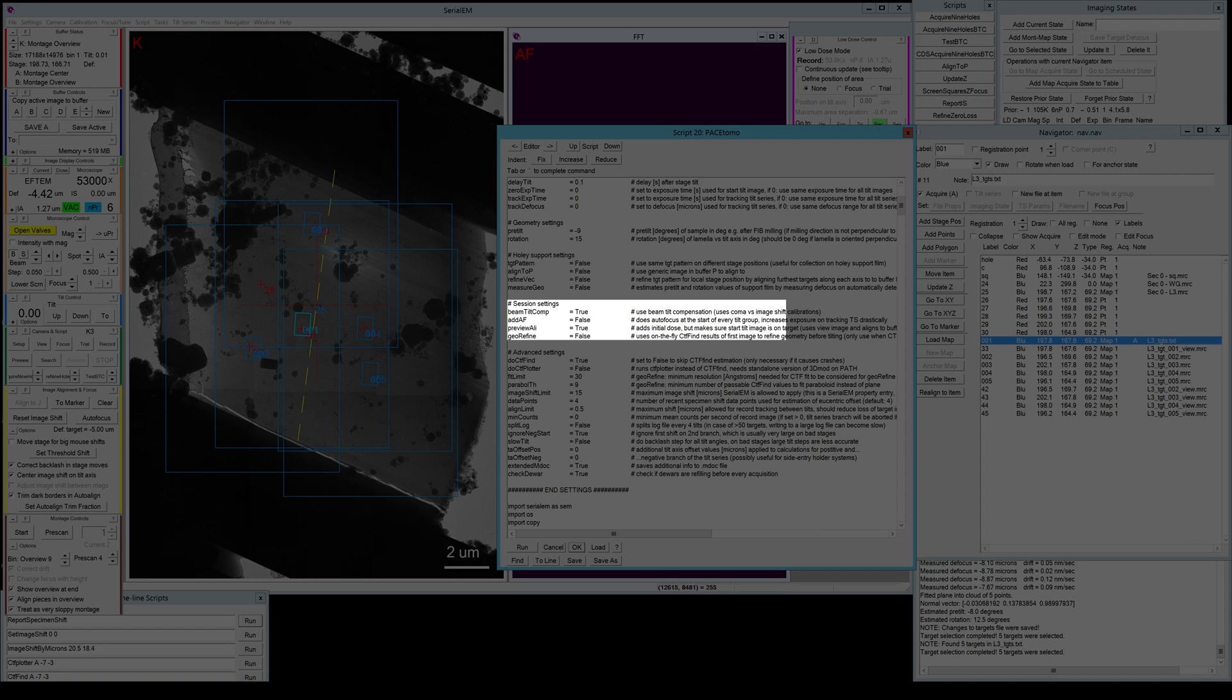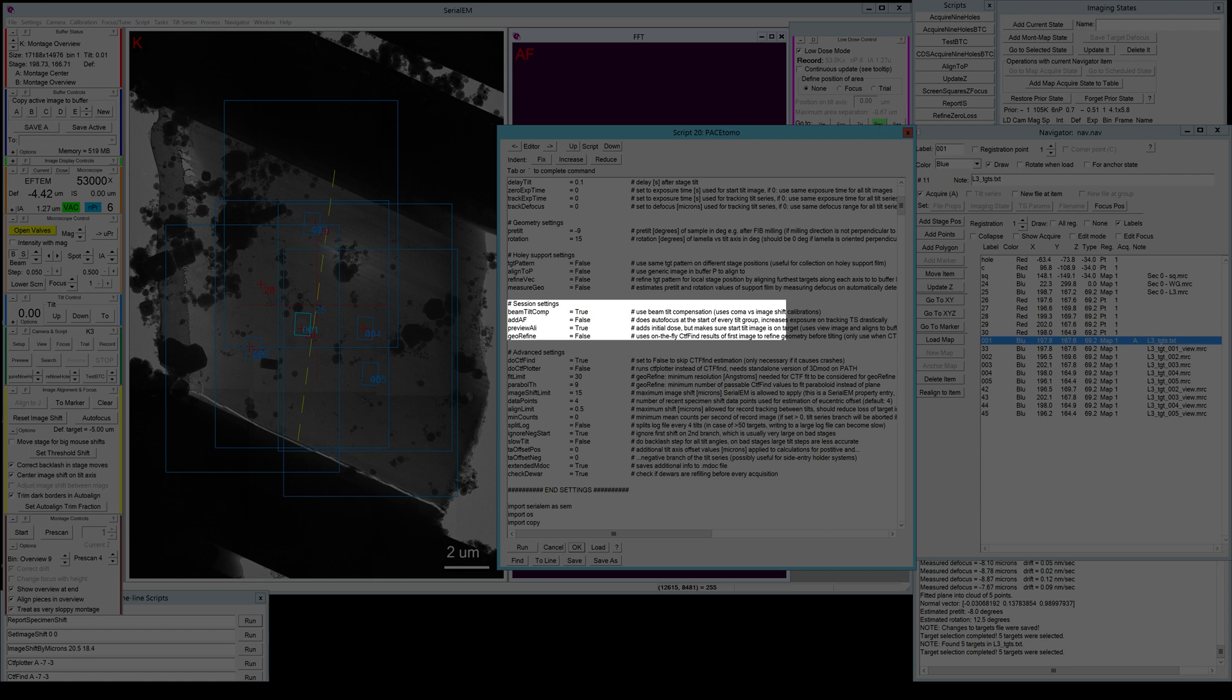And the georefine feature is something I also rarely use. I use it more often for the holey support films. But the idea behind that is that it takes the first tilt image and it runs a CTFfind or CTFplotter to estimate the focus from the actual record image of your target area and then uses these values to refine the geometry of your overall target area.